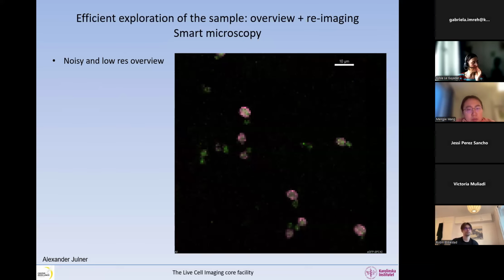So in Nikon, it's called Jobs. And I think in Zeiss, what is it called? Anyone knows? Is it something experiment? I'm not sure, but let me explain to you what it is. Maybe it comes back to your head.